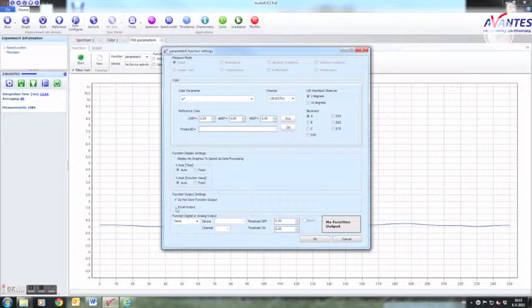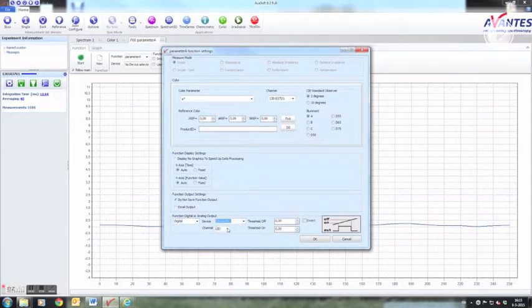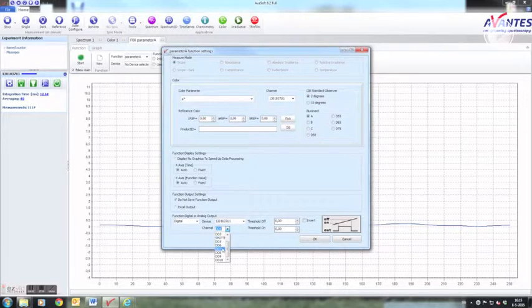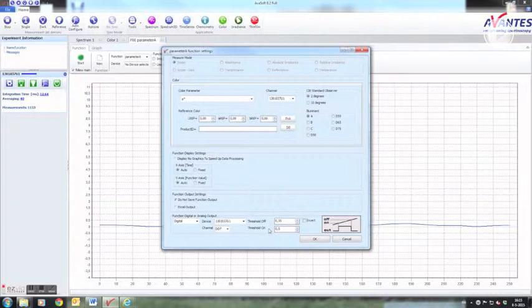With the function digital and analog output you can make use of the analog and digital output functionality on the Avantes spectrometers. You can set for instance a digital output DO7 which will be activated if the parameter measured reaches certain values. This way you can, for instance, set a warning light in the factory.